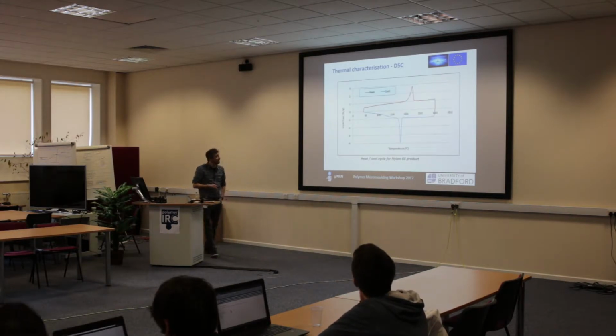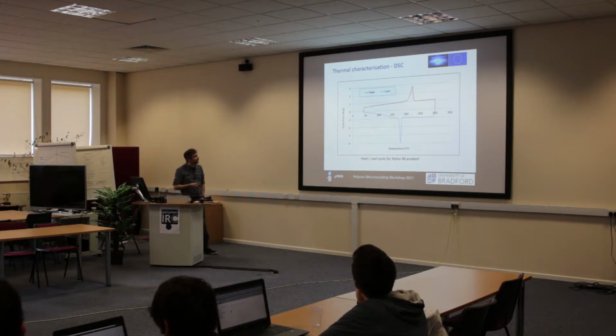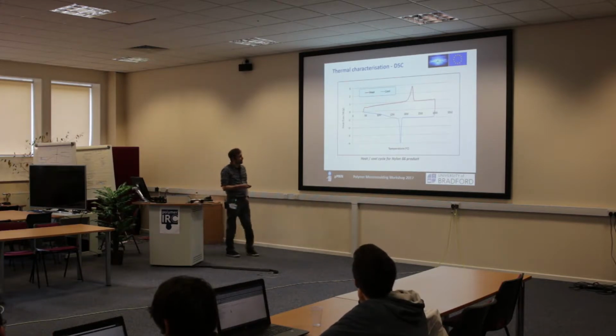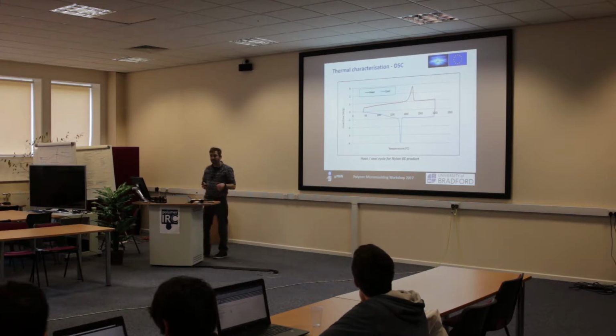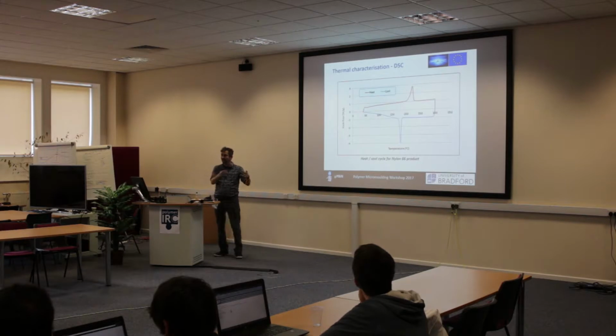So this is a typical trace. This is for nylon 66. This is when I was working for a company trying to figure out why their nylon products, which are in deep mines in Siberia and Australia, keep wearing out. And they were to make tracks to take water and electricity to the coal seam in these mines.